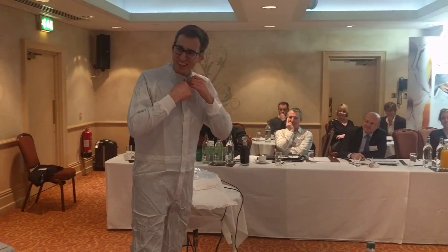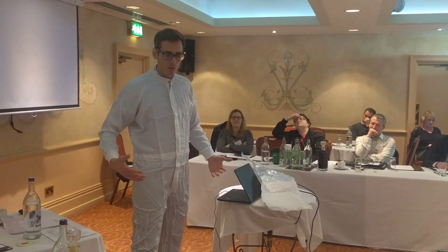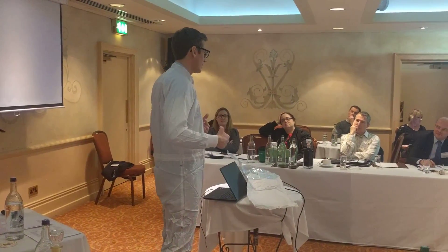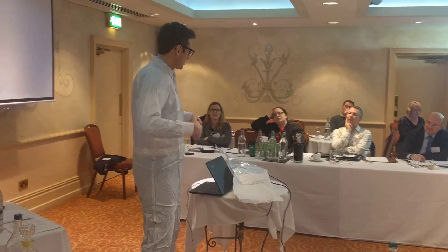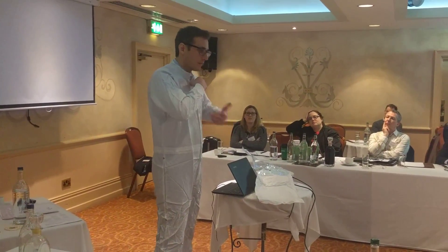How about the de-gowning? That's also a question we've had. Depending on the situation — in the aseptic area, you will probably use a sterilized new overall. But in some productions, it's also a matter of avoiding contaminating yourself from the product. So again, the same principles apply: try not to touch the outside, try not to touch the floor, and avoid touching undergarments.